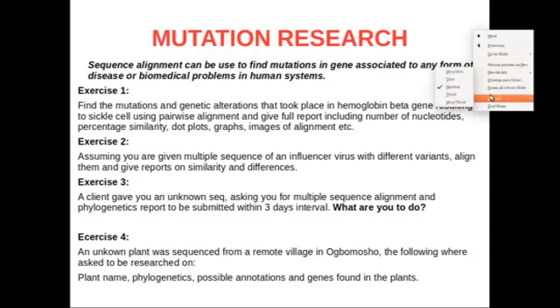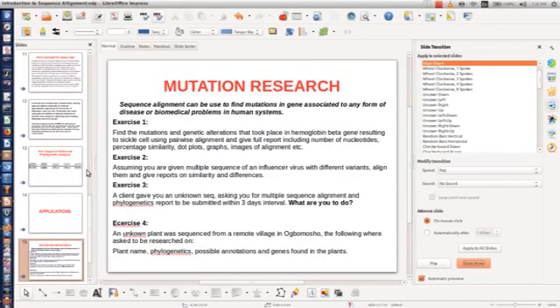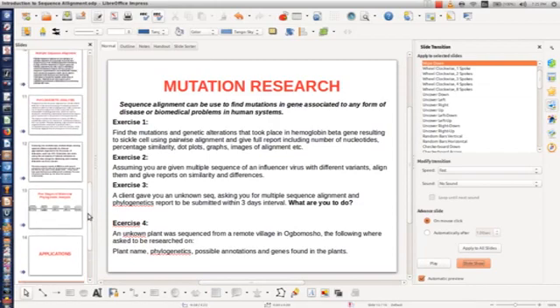We have actually been working on a particular data set, which is the hemoglobin beta gene that results in the sickle cell problem. That is the gene that exists, where the mutation took place, in hemoglobin in the body, in the blood. So all we need to do right now is look for variations of this sickle cell, this mutant gene, on the database. But these sequences belong to different patients, so there's a probability we have a lot of variations in hemoglobin beta genes from different patients.